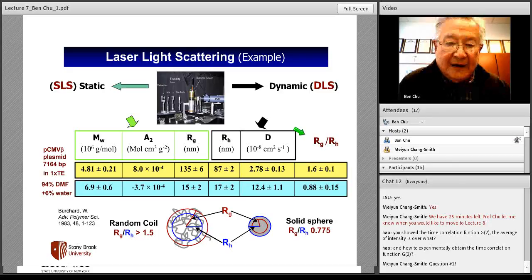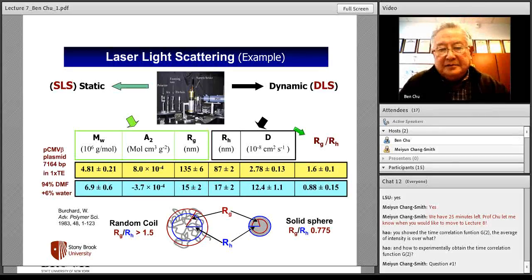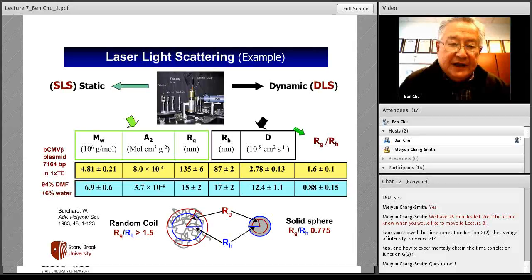But now how far can you go? Well, using photon counting, and using X-rays also with photon counting, looking at the difference in refractive index, you can count every photon. For example, we can make measurements of the scattered intensity coming from water, which really is a pure liquid and scatters very little.